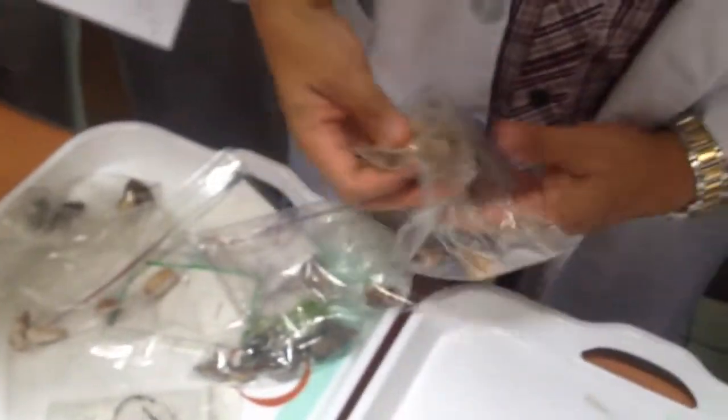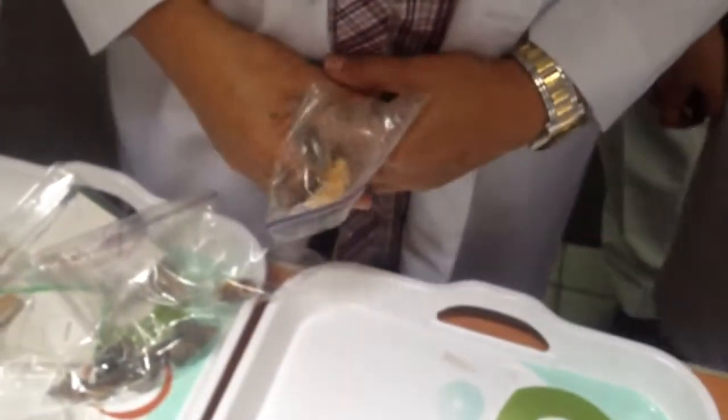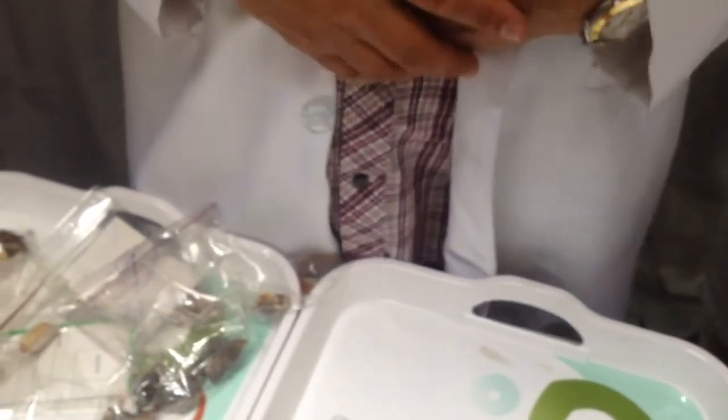Okay? I think this is the last one. I recommend that you examine them individually. And then we meet in 5 or 10 minutes for the microscopic.